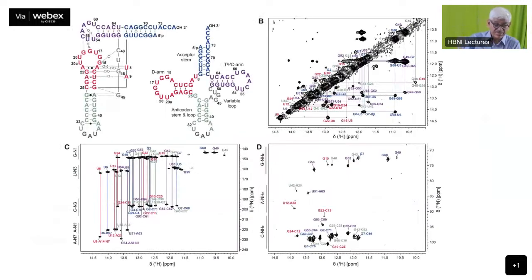For all of this, you now also have to use heteronuclear NMR experiments. Homonuclear NMR alone is not going to be adequate there. We need to use heteronuclear NMR experiments as well. And for this, of course, you have to have the labeling. This is quite an expensive proposition. To label DNA or RNA is not easy.